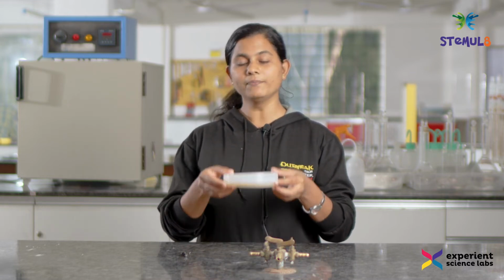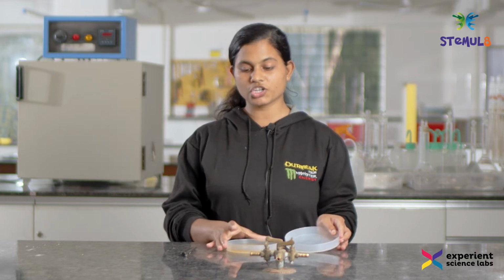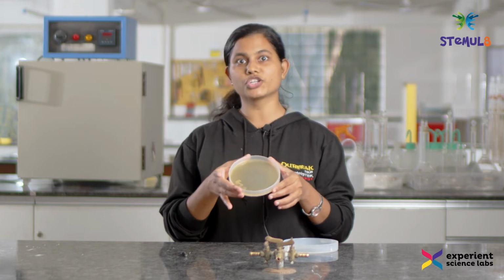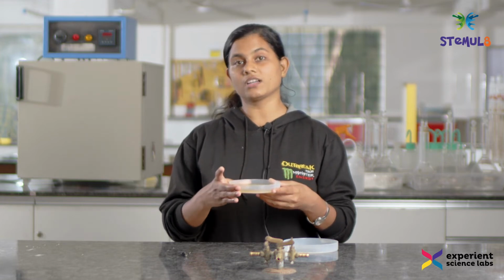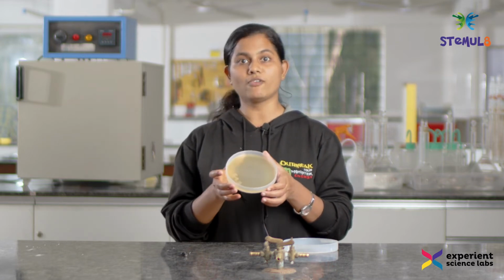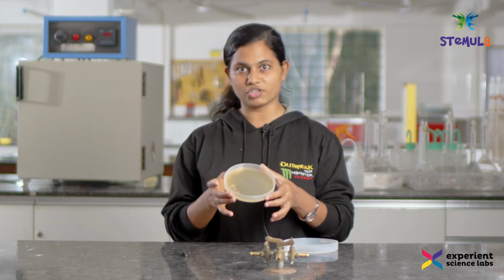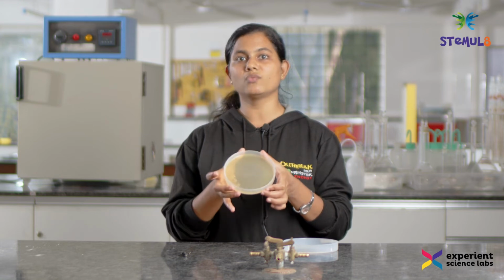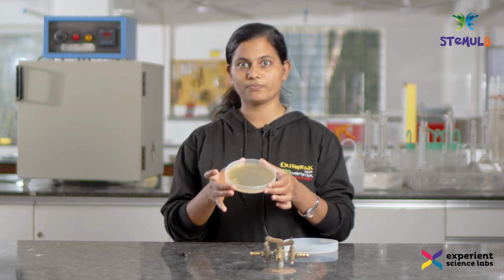I have a petri dish here, and in this petri dish I have prepared an agar nutrient solution. I have taken around 1.4 gram of agar and dissolved it in water and prepared this nutrient solution. I have poured it into the petri dish. This would be the medium in which the bacteria is going to grow.